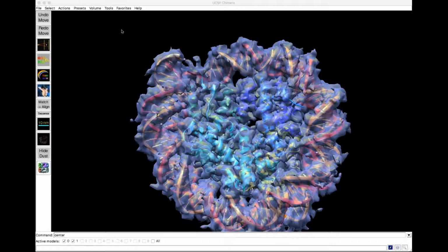the residue sequence. One really nice thing about Chimera is that if there's information in the PDB header indicating all of the residues that were in the crystallization construct, it'll include those even if they're not modeled. So everything in this red box is the H3 tail that's not resolved in the crystal structure, but it's nice to see that sequence. Here, the first visible residue in the structure is this proline, and it goes all the way to this arginine.